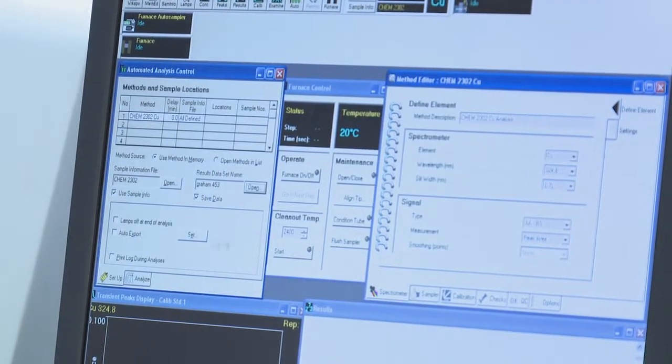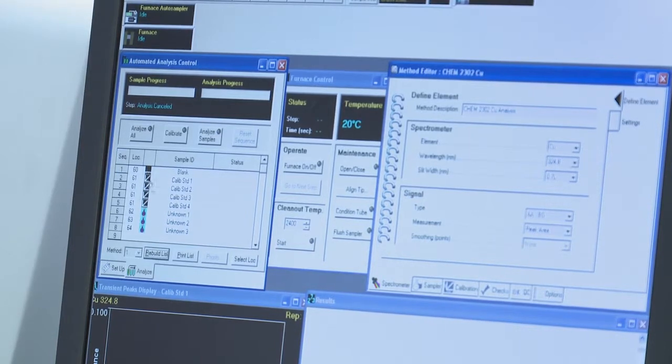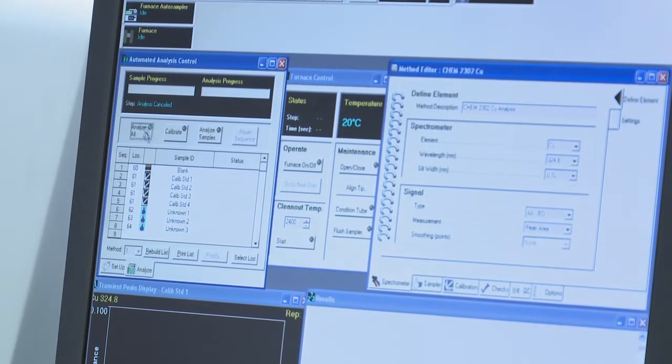And then you're going to come down to the analyze tab, click on the rebuild list, and then you're going to click on analyze all. That's going to start the run.